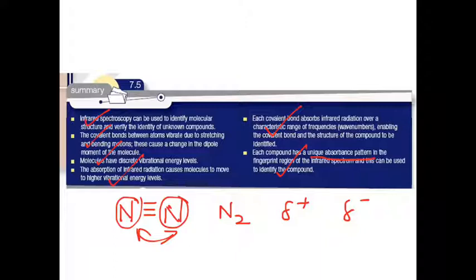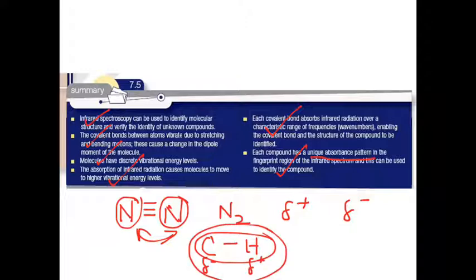So you have to have a dipole moment. You have to have something different, such as CH, something like that, okay? There's a dipole associated with that. Basically, the carbon, although it's not very electronegative, it'll be a little bit more electronegative than the hydrogen, but not much. But nevertheless, there is a dipole, and that's the kind of thing you need for IR to work in terms of these functional group behaviours and the resonant frequencies that they will absorb.